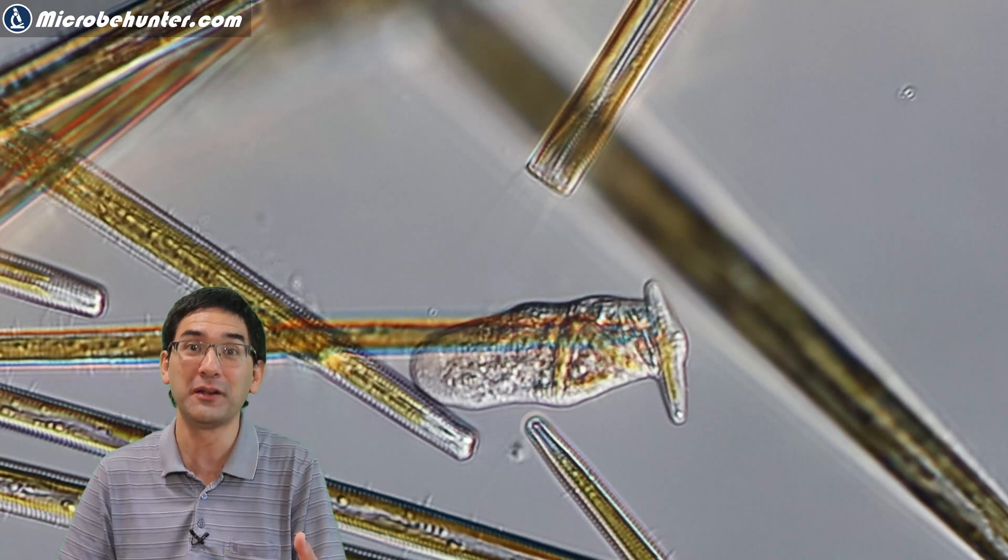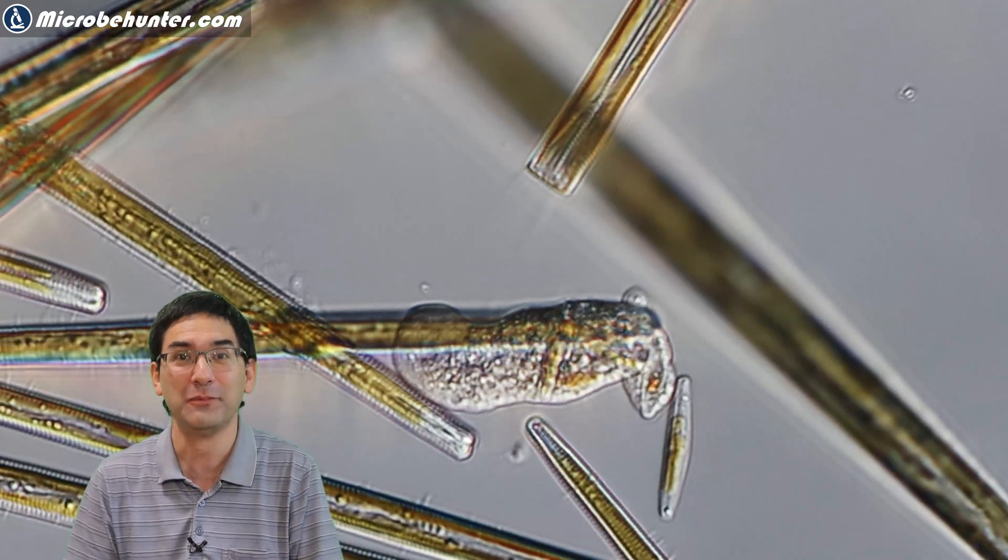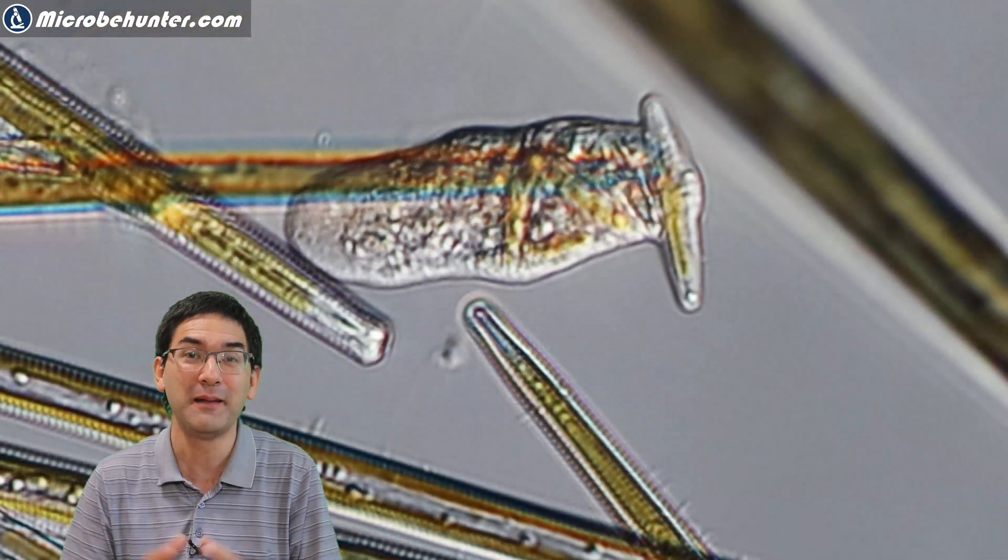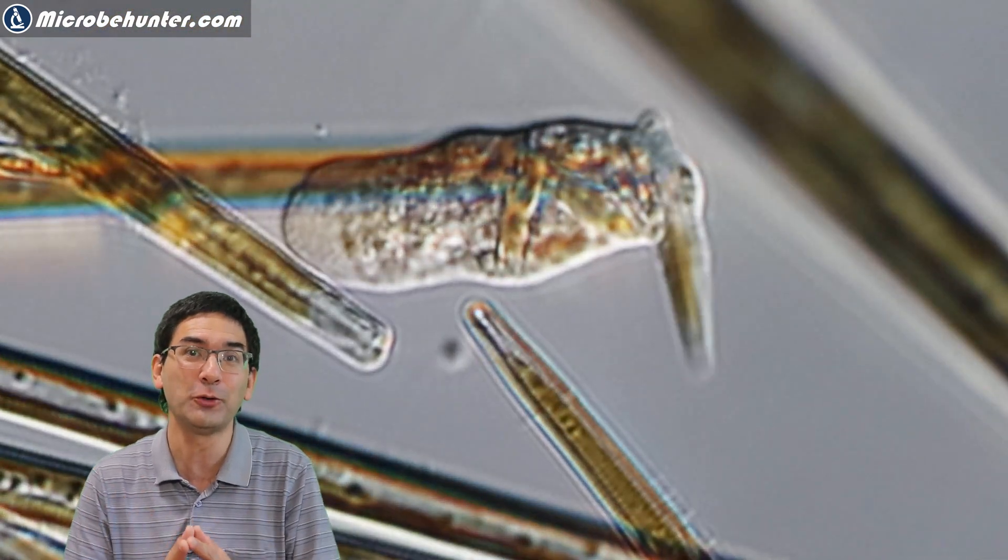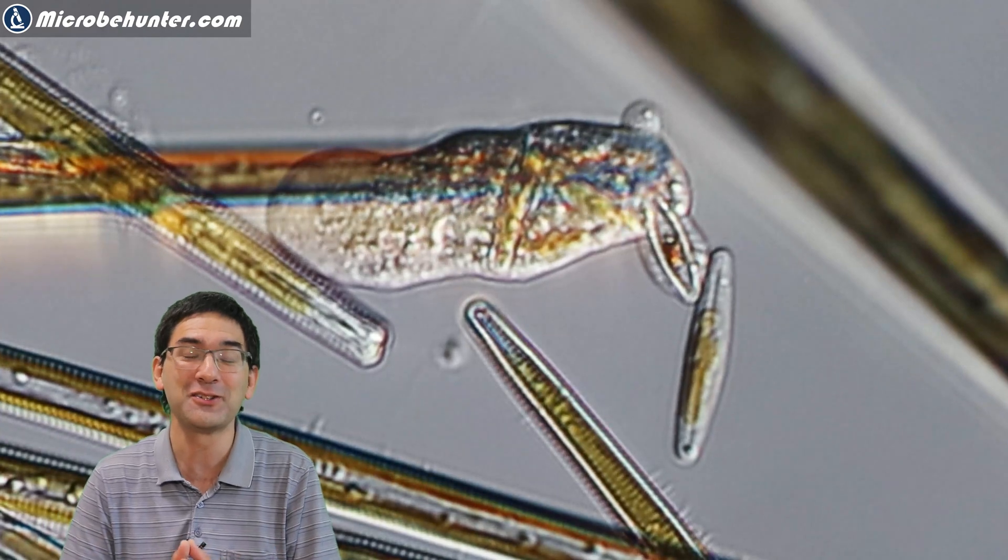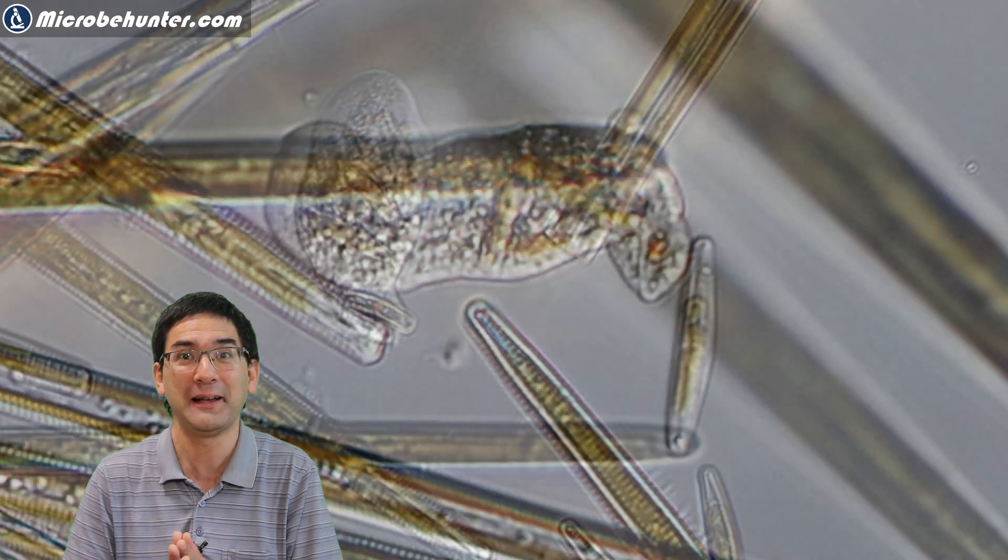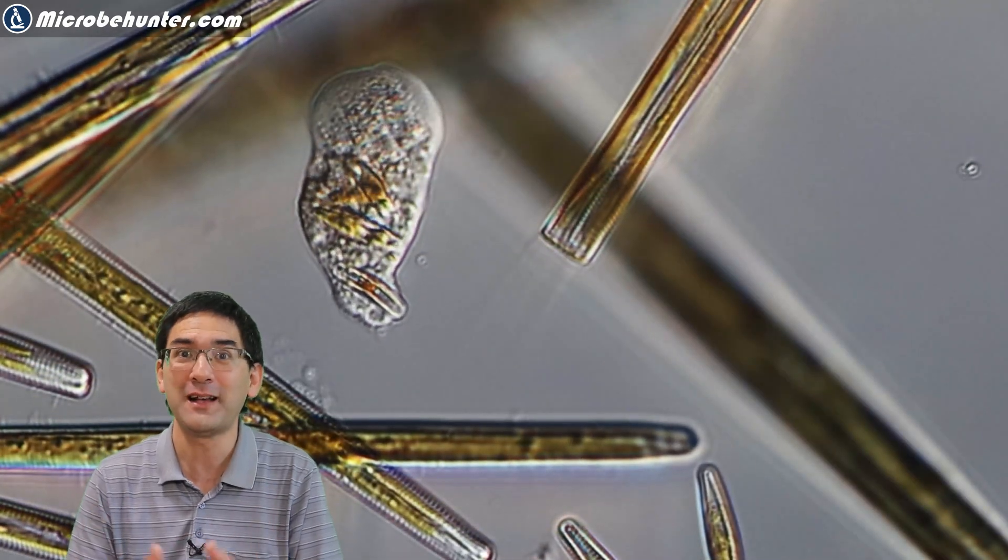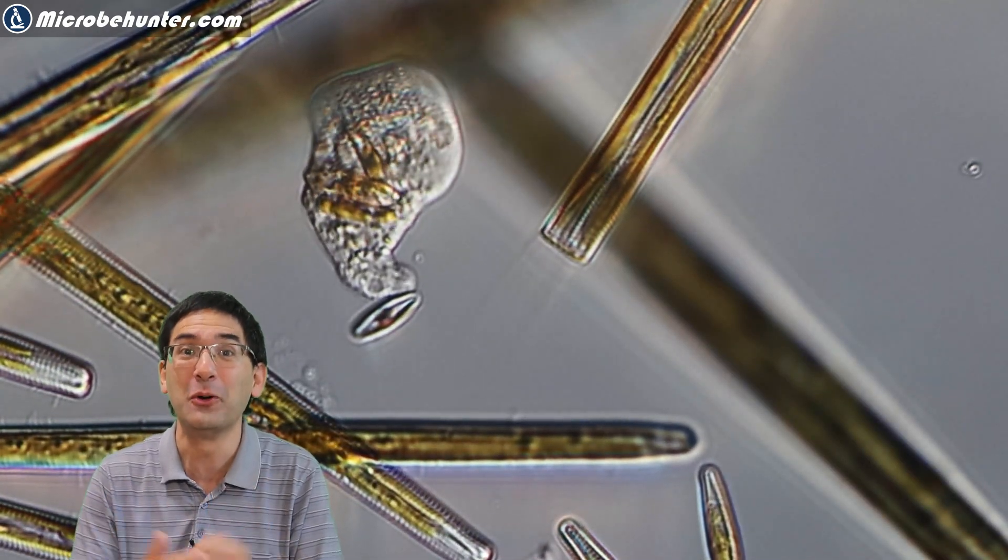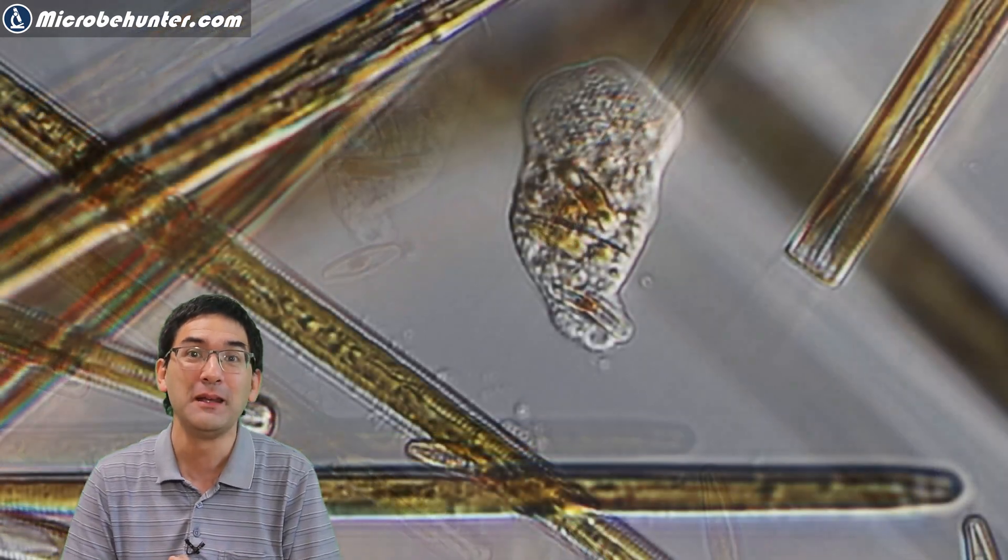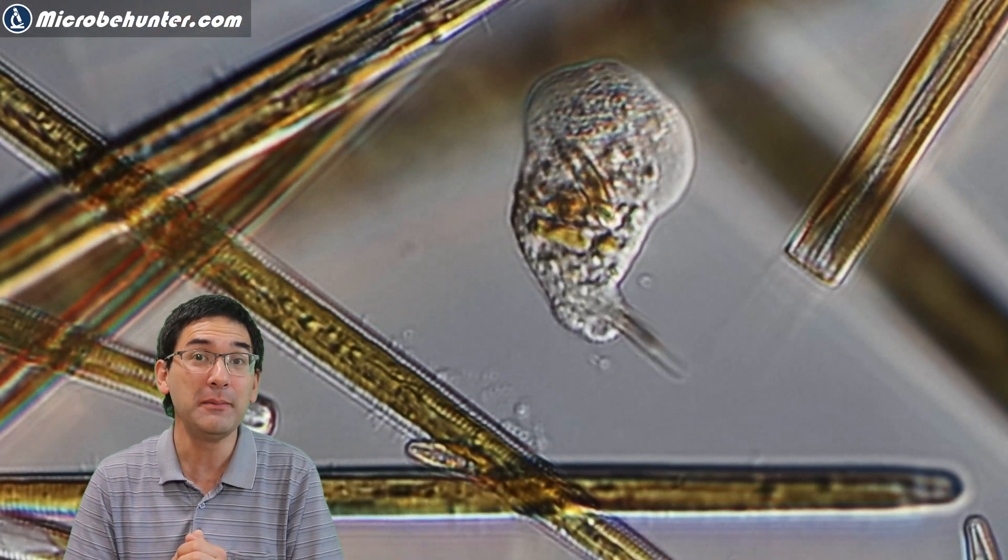Here again we have a look at an amoeba which is now expelling the diatom. A few seconds later, I saw it again—the very same amoeba expelling a second smaller diatom as well. It went so fast that I also did this a little bit in slow motion so that you can see the process a little bit better.